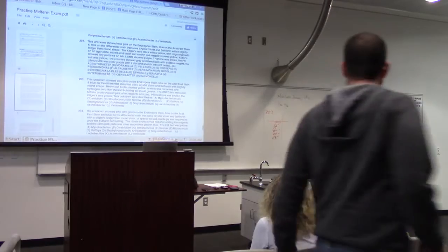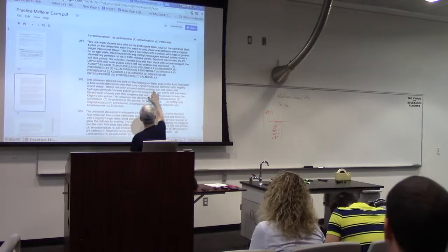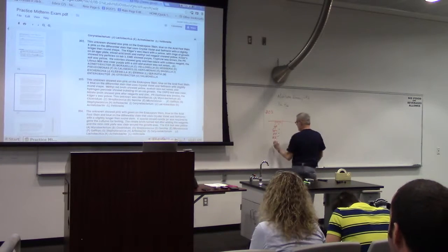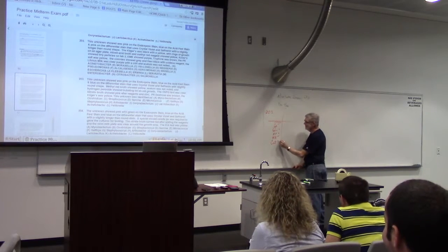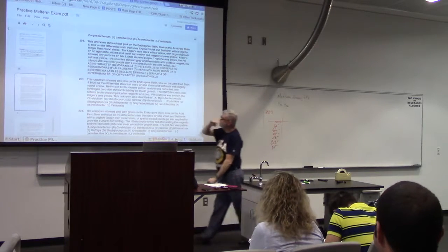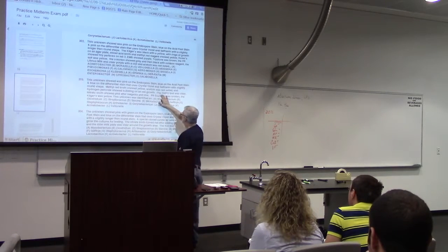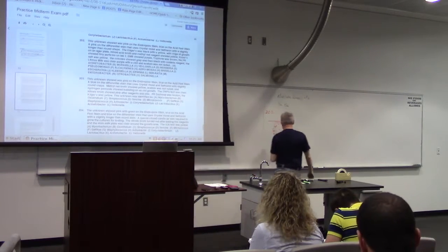All right. So methyl red is negative. Okay. Acetoin was not noted, so that's VP negative. Hydrogen peroxide was bubbling. So your catalase. Bubbling, and the VP remained brown, so it's negative. Oh, but it doesn't say after reagents were added. Hydrogen peroxide, that's the reagent. Okay, the ONPG test was clear, so that's lactose negative.